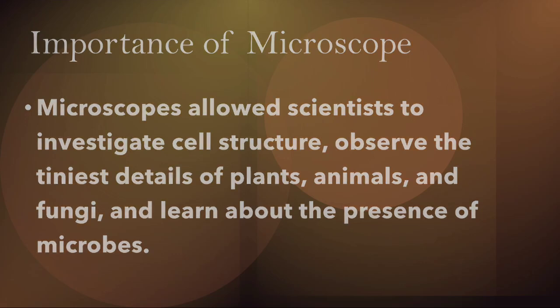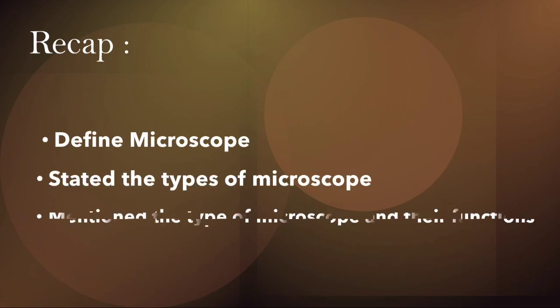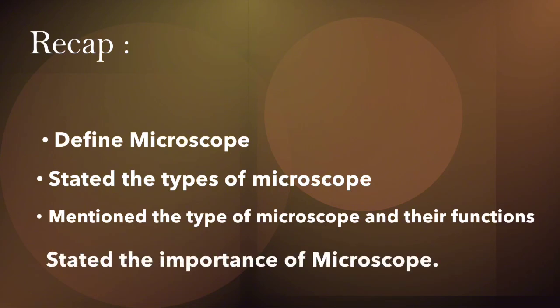Okay, so let us recap. We defined a microscope. We also stated the types of microscope and their functions. And we also stated the importance of the microscope.